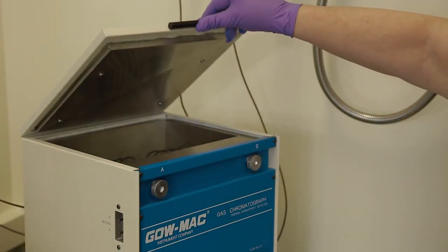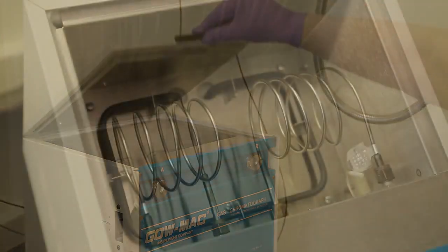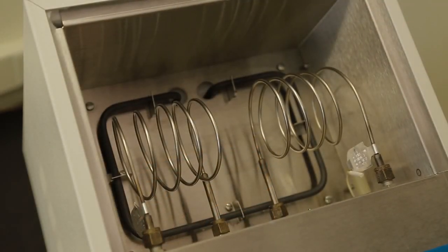A gas chromatograph is an instrument with a long column filled with small particles coated with a very thin layer of an adsorbent. This layer is the stationary phase of the column.